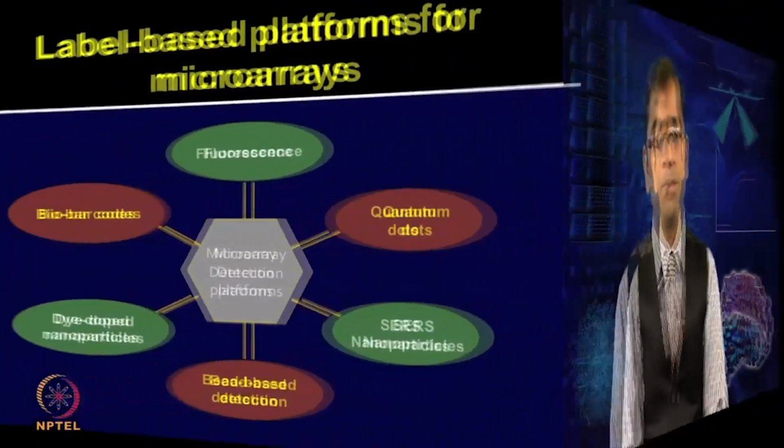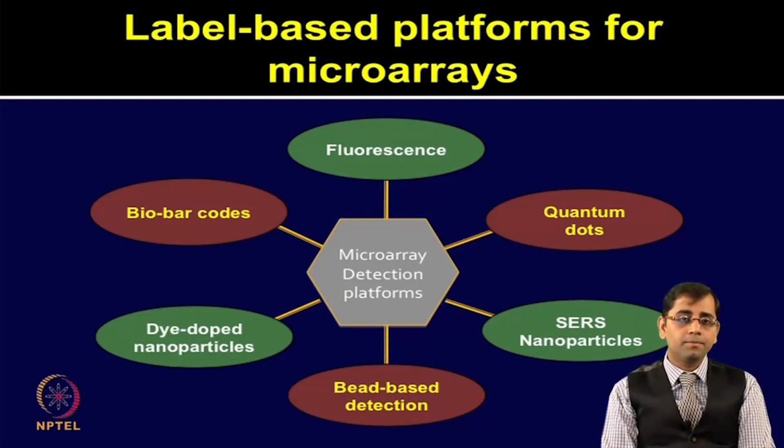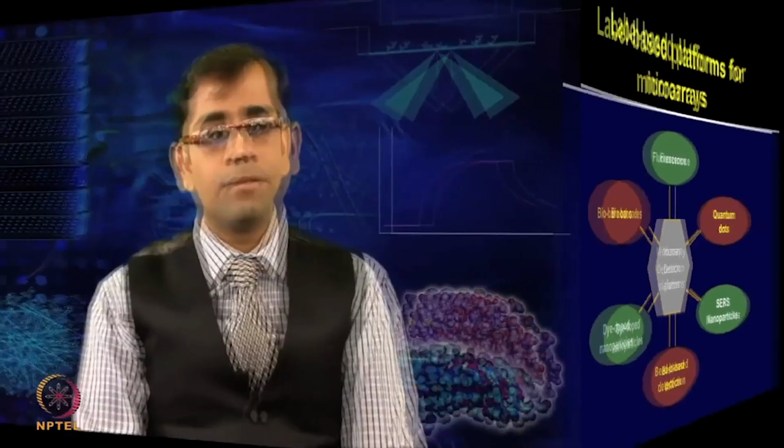In today's lecture, we will talk about conventional label based systems and discuss each of these platforms in detail. And in the next lecture, we will move on to more recently developed advanced platforms used for the label based detection systems.